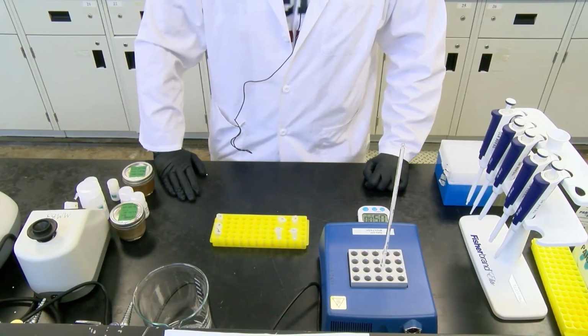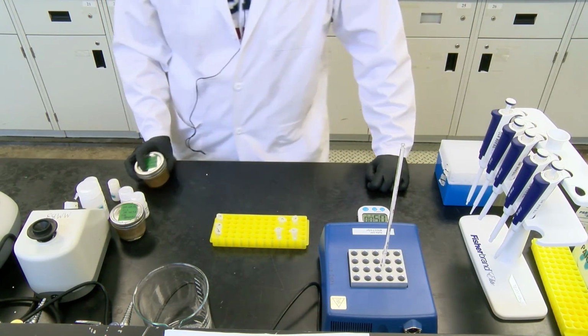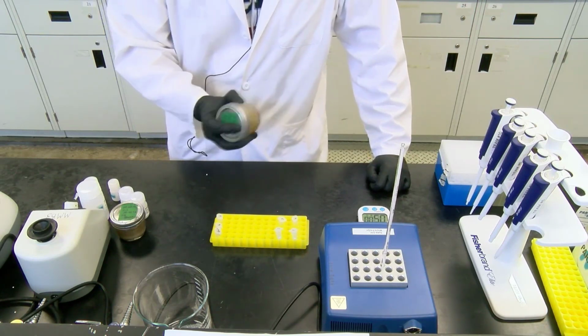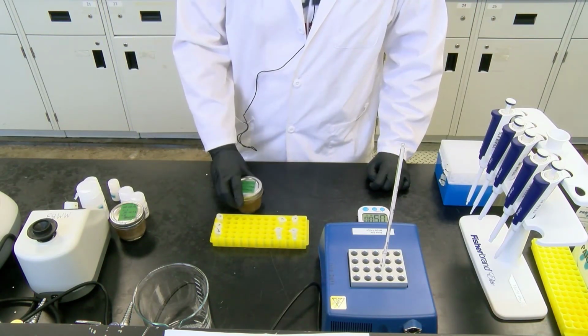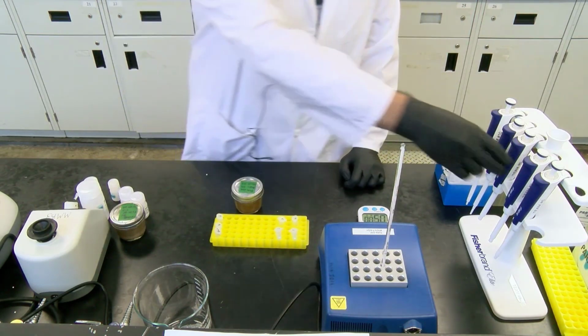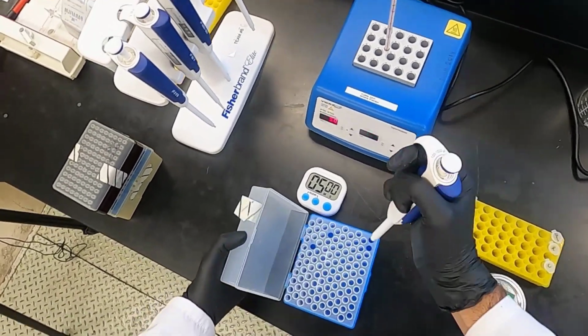Today we'll be using the gene bioextraction kit to extract DNA from our samples. So the first thing we're going to do is prepare our samples. Make sure it's mixed. If it's a liquid or a tissue sample, make sure you add it into your solution. First, we're going to add 400 microliters of our sample into our test tubes here.